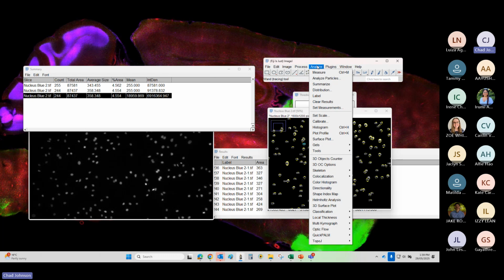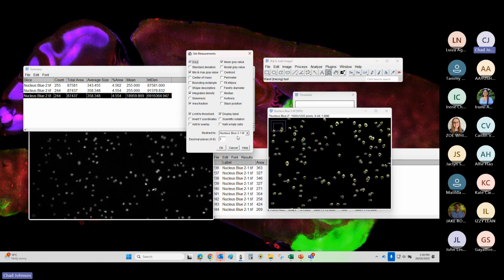Now, just remember, when you move on to something else, to redirect it to none, because otherwise it's an error. It can't find this particular image if it's not there.